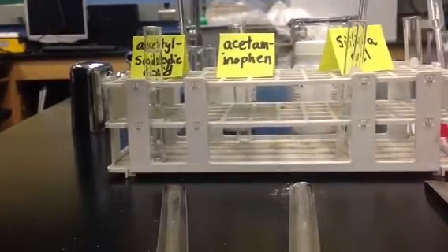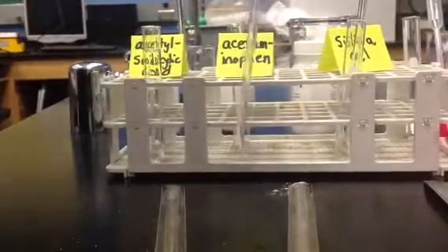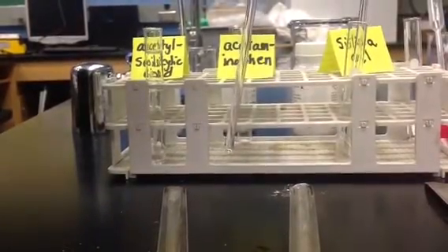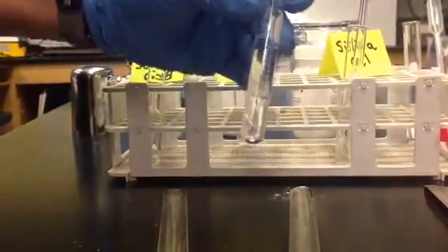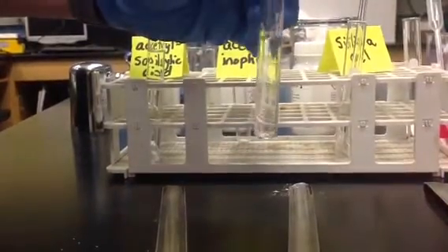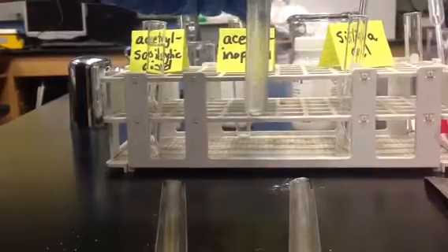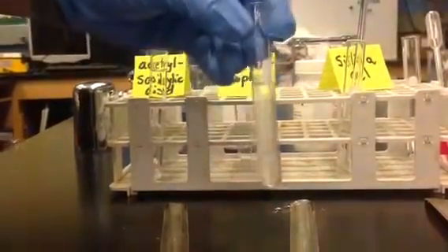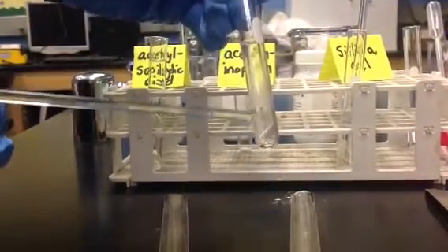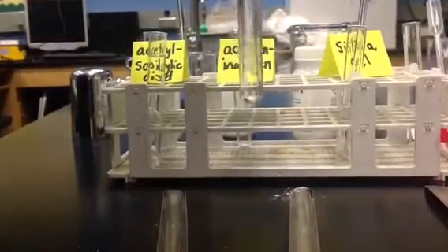Let's try it on our acetaminophen. We already know they're immiscible, but I want to see if it's going to cause my solid to precipitate, what dissolved in. And you can see the water layer forming at the bottom, and nope, I don't get any reprecipitation.